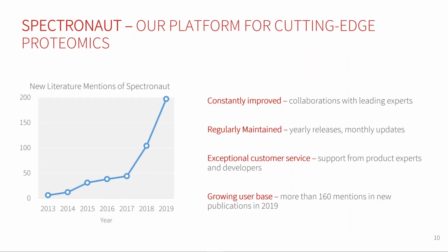We are regularly improving and updating the software, so there's a new release with new features every year and regular updates for smaller improvements as well. And we have a highly qualified support team in place, and the developers themselves are in touch with customers as well to help them get everything to work perfectly.